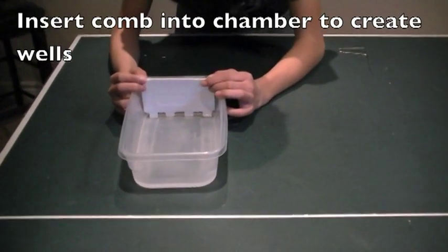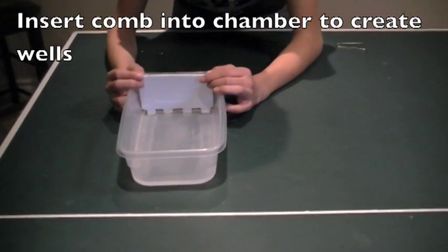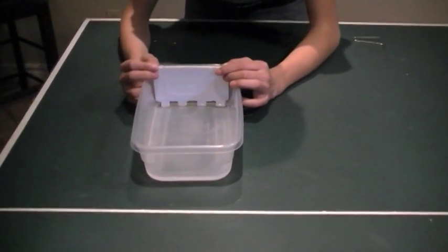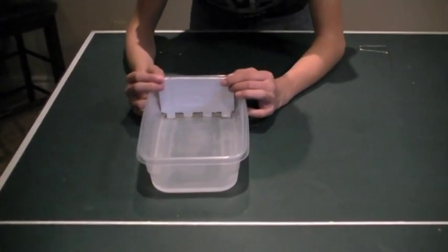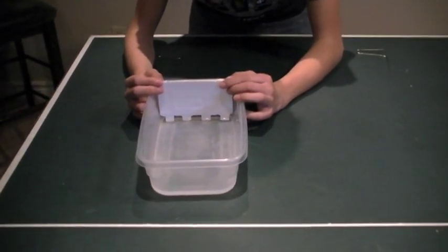Insert the styrofoam comb into either end of the gel chamber, leaving approximately 0.5 centimeters between the end of the box and the comb. Gently pour the agar solution into the gel chamber. Add just enough solution to the box so that the comb teeth are submerged approximately 0.5 centimeters.